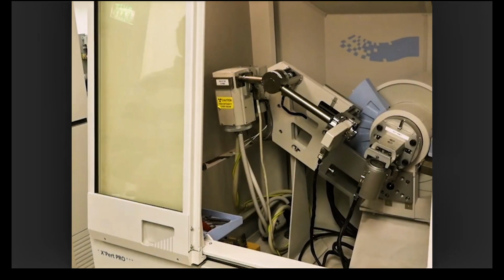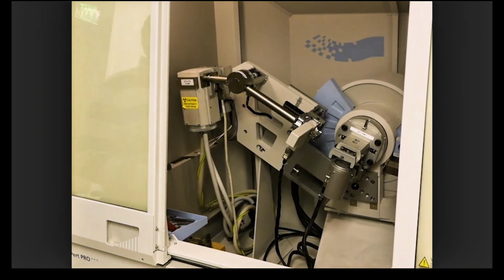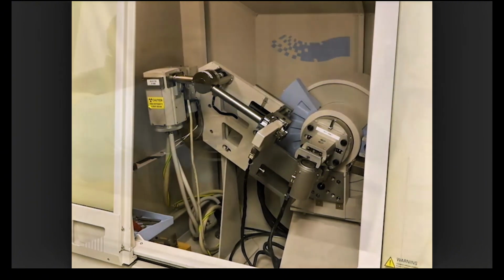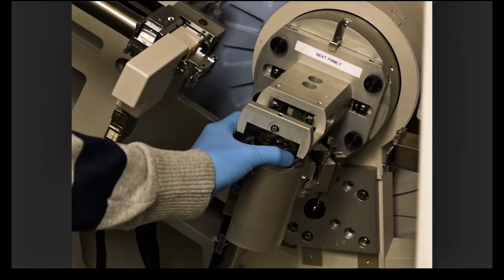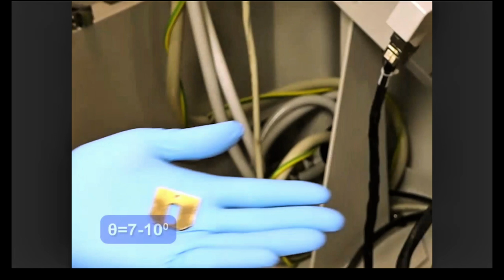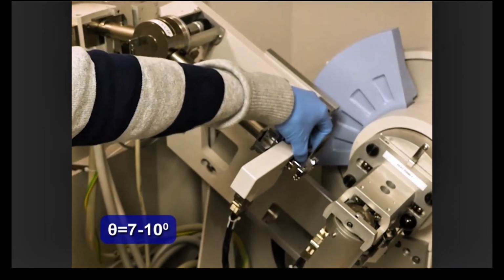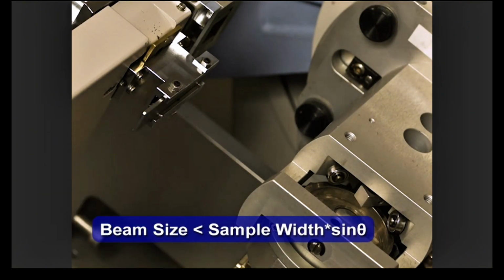Note that the following procedure applies to a specific XRD instrument and its associated software, and there may be some variations when other instruments are used. Load the sample in the sample spinner stage and lock the sample into position, making sure the irradiated side of the sample is parallel to the sample stage. Use a mask to adjust the X-ray beam size of the instrument according to the sample diameter. At the smallest incident angle, the beam must have a footprint smaller than the sample width.